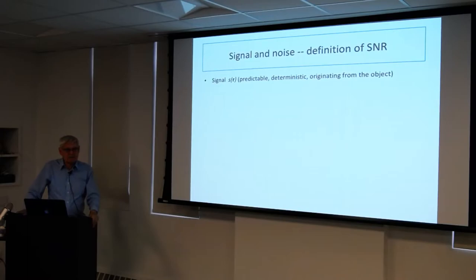So there used to be a time when modular image processing systems were used. SPIDER was one that I developed a long time ago. There were other modular systems. The idea of modular program systems is that you have modules, and each of these modules is doing a certain task and doing it properly: Fourier transform, autocorrelation, cross correlation, shift, rotate, and so forth. You can put these modules together by invoking them with commands. In other words, you write a script.